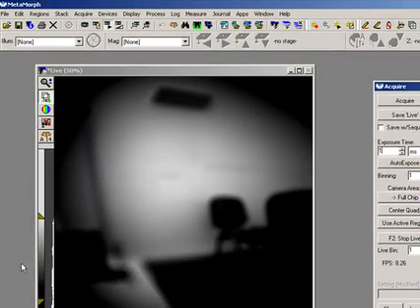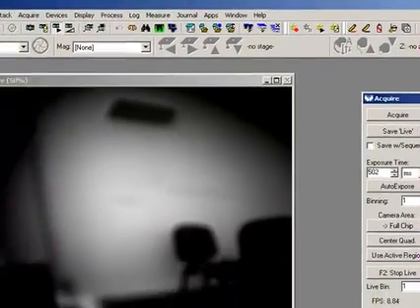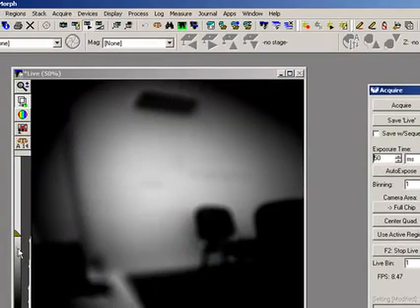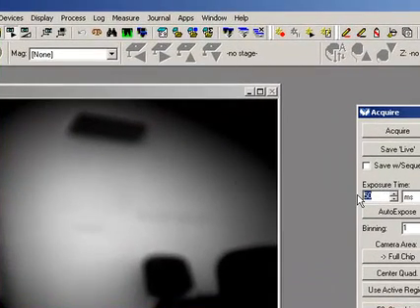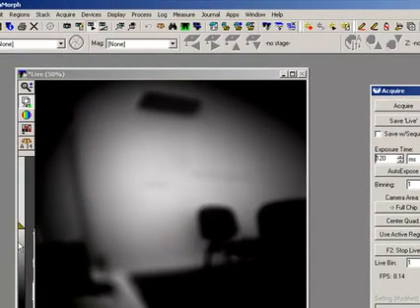But if we look at our histogram here and I click go, you see it stepped for a moment and I was getting a 1 millisecond exposure for the first image, and then after this I'm back to exactly the same image I had before with 120 milliseconds. So I can put in 50 milliseconds here, and it takes me exactly to where I was before, and I can enter in 120 milliseconds, and then it just jumped ever so slightly, but that's because I'm past the read time now, which is exactly where I want to be.